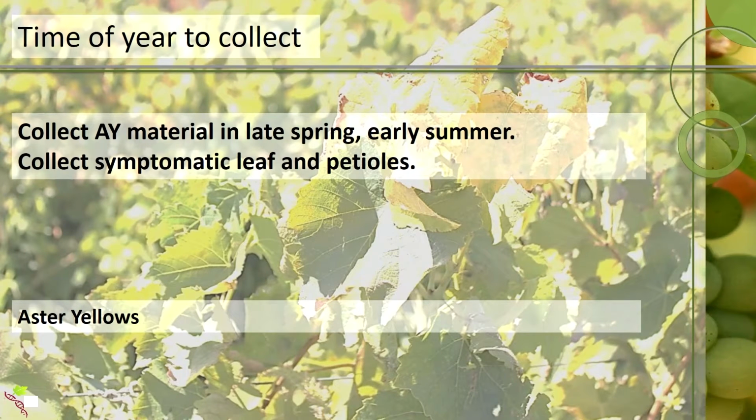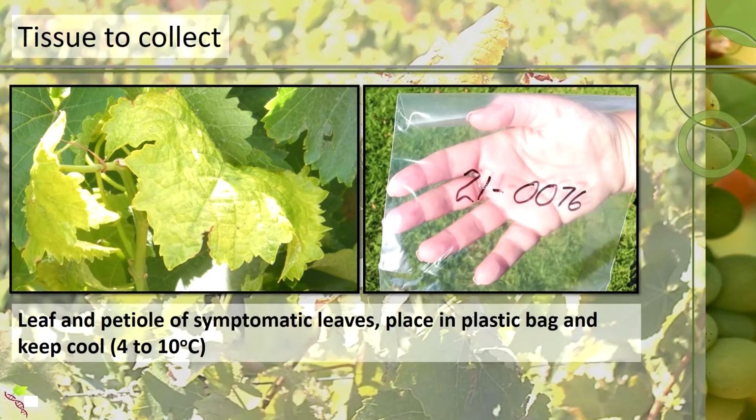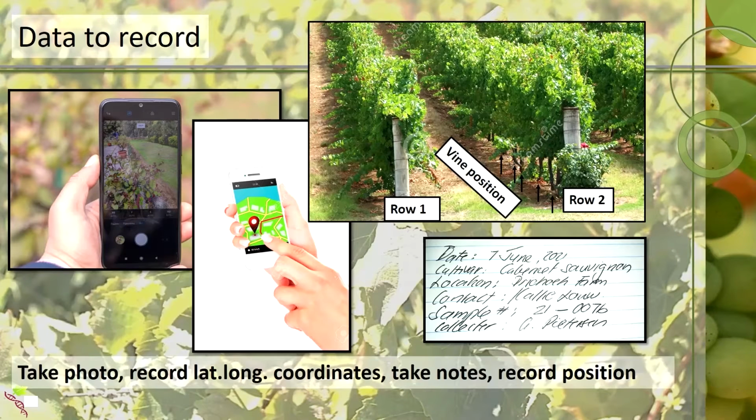Because the symptoms are best at this time and the pathogen is in fairly high titer, late spring and early summer is the best time to collect this material, and we recommend that only symptomatic leaf and petiole material be collected. This must be placed in a plastic bag. Here we have a plastic bag with the accession number for that specific plant, and this has to be kept cool, basically between 4 and about 10 degrees, until it gets tested for the Aster Yellows phytoplasma.